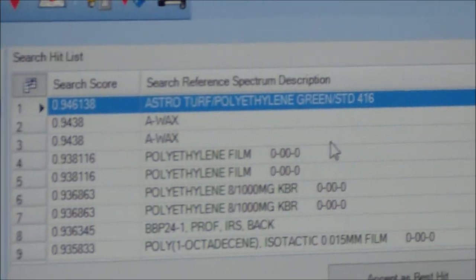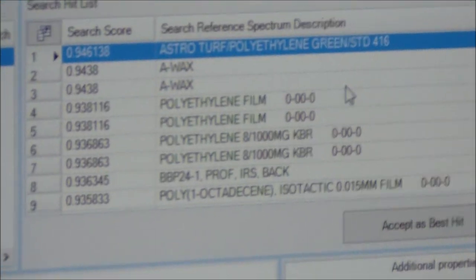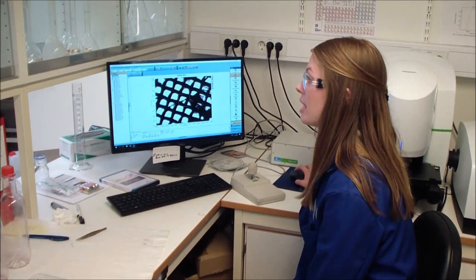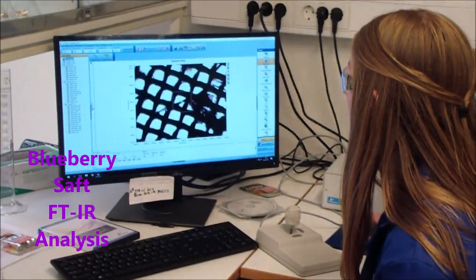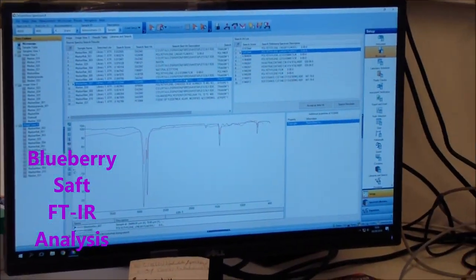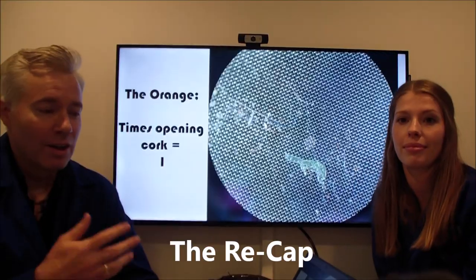So now I'm looking at the blueberry sample, which had many fibers in it, and you can see this one here turned out to be a polyethylene polymer.